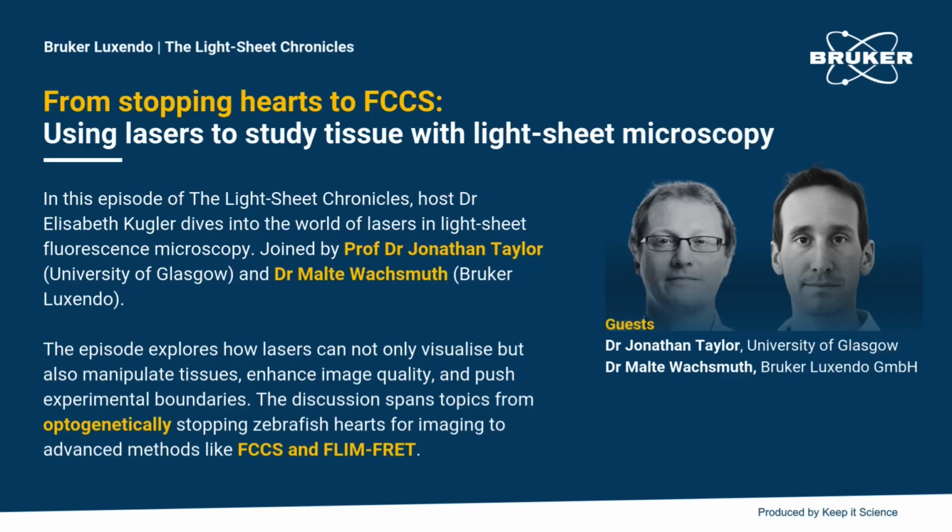What I find so interesting and exciting about in vivo imaging is also the thing that makes it really hard and challenging. If you were trying to ask a simple question that could be boiled down to something that could be studied just in cultured cells or in an explant or a simple organoid, then we wouldn't be trying to do this in vivo because there would be an easier solution. But when you're tackling these complex questions, you really need to know what the whole complex living organism is doing, and all of that is feeding into the biological question, which means that all of that has to be taken into account and included in the imaging that we're doing, ideally.